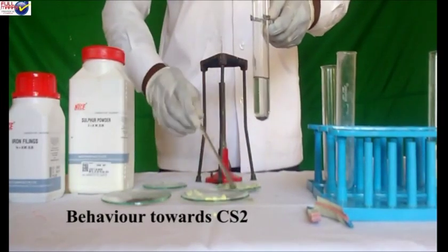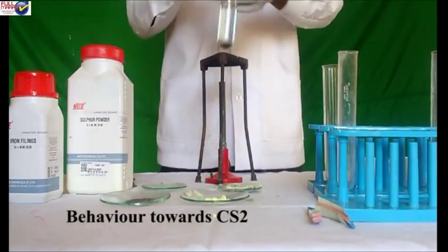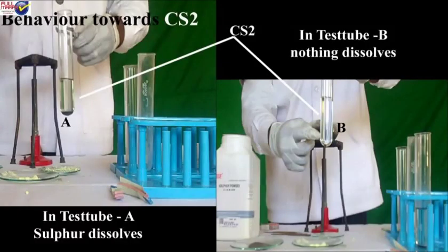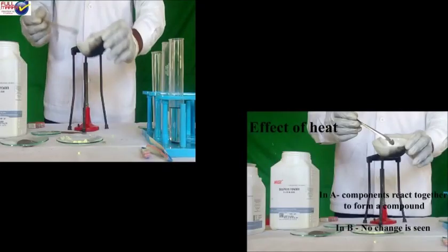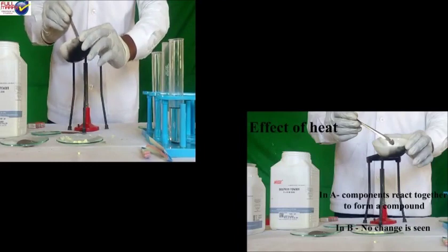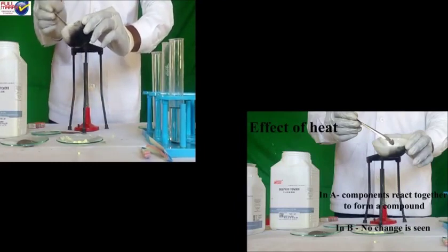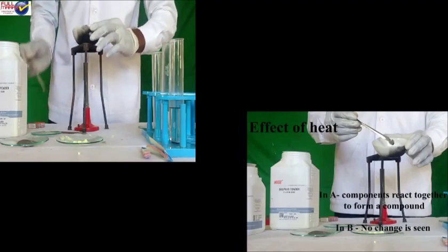Behavior towards carbon disulfide. Take components from watch glasses A and B in separate test tubes and add carbon disulfide to them. In test tube A, sulfur dissolves in carbon disulfide and iron settles down, whereas in the other test tube, nothing dissolves. Effect of heat: on heating the mixture from watch glass A, the components react together to form a compound, but no change is seen in the compound from watch glass B.